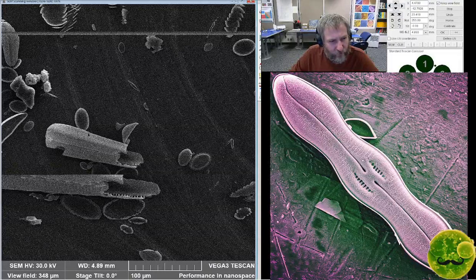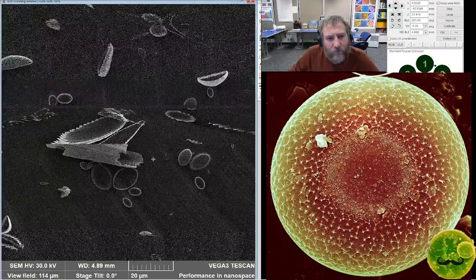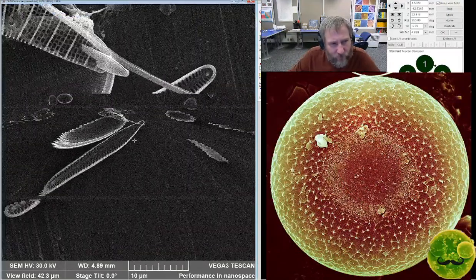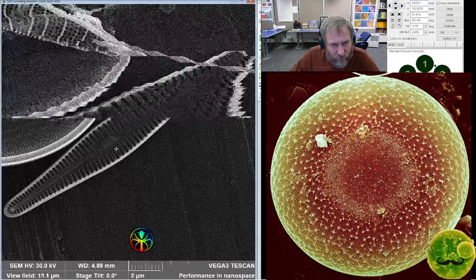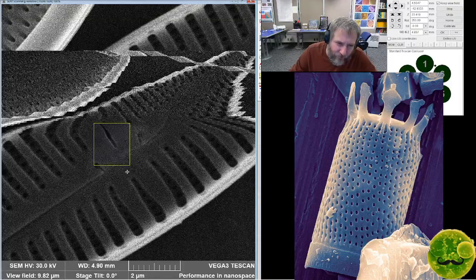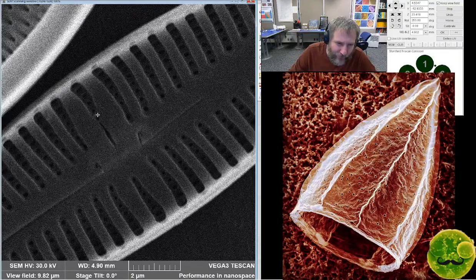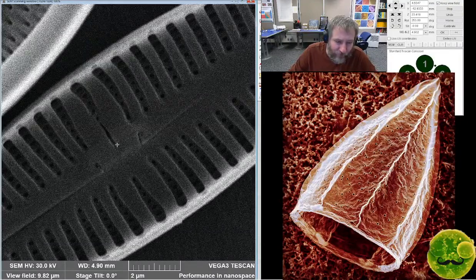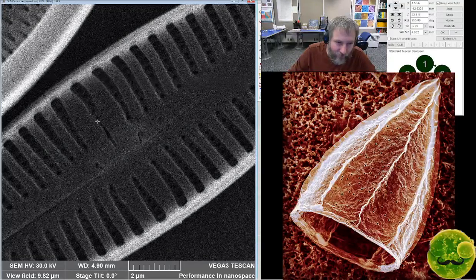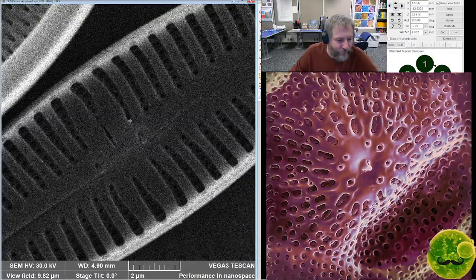There's a big Rhopalodia in the background, and Epithemia. There's a little one, a different species. This one belongs to that same group as the one that I thought was Afrocymbella. Not quite right. It has these twisted up ends and a slot-shaped raphe, or stigma, that comes off of the central striae, but doesn't have the little cat face intermissio.